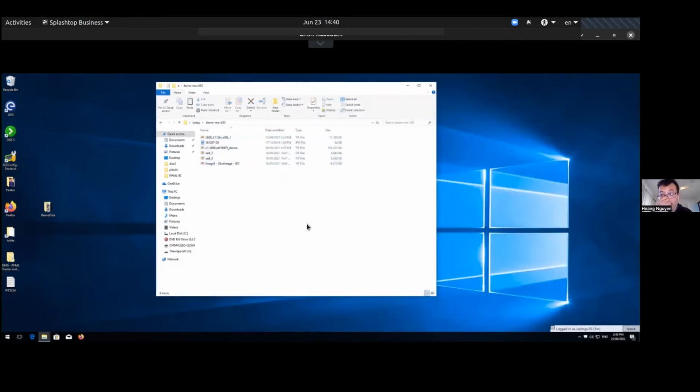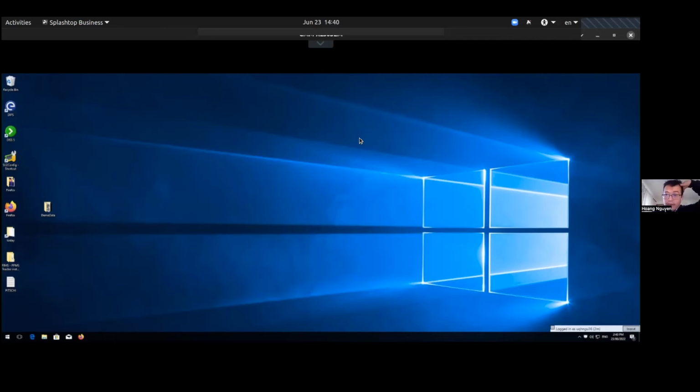What's happening in the background is that as soon as the user logs in, Pitschi will start a background process that is triggered every few minutes, and it will copy the data in this today shortcut folder to the project's RDM. As soon as the user logs out, the RDM will be dismounted. How often the sync process is done can be changed as part of the configuration.